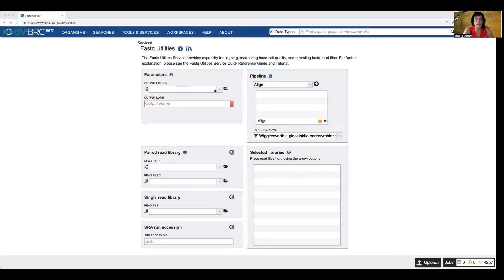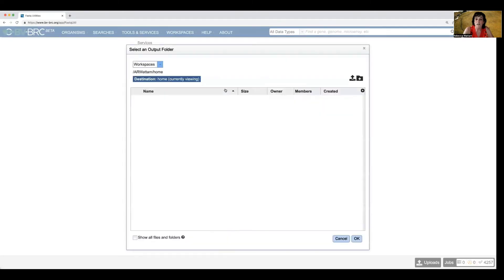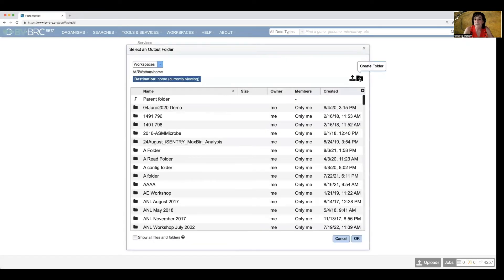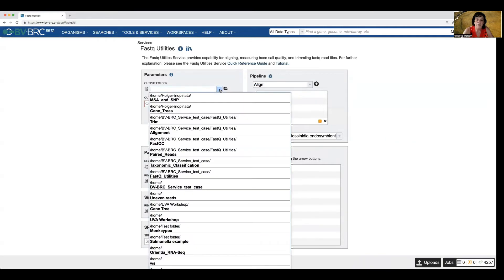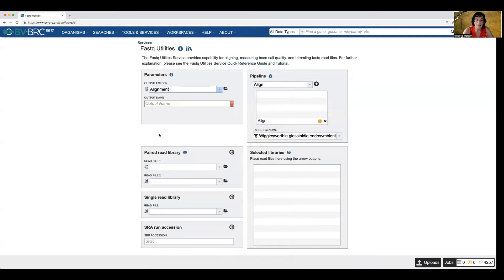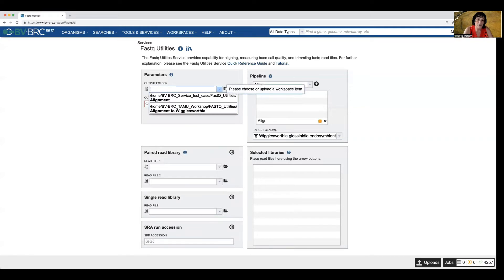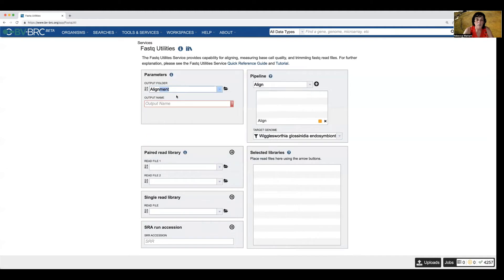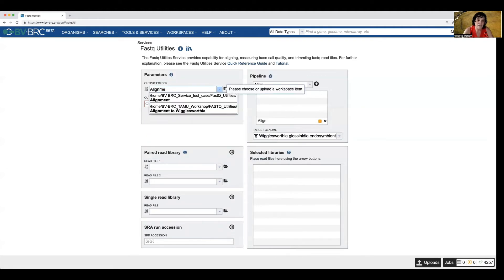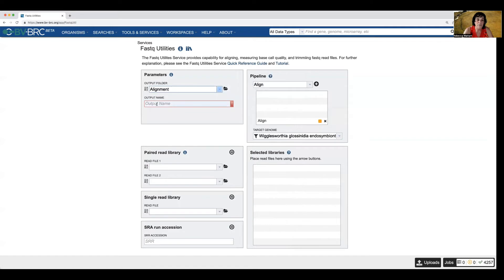Let's go back to parameters. If you don't know, or you haven't created a folder yet for your job, you could click on the folder icon, you could create a new one, or you could cruise through here to find one. Or if you've done one recently, you could click on the down arrow and choose that. And of course I could always just start writing in the box and I could see all my recent folders that match that. And then choose the one that I want.